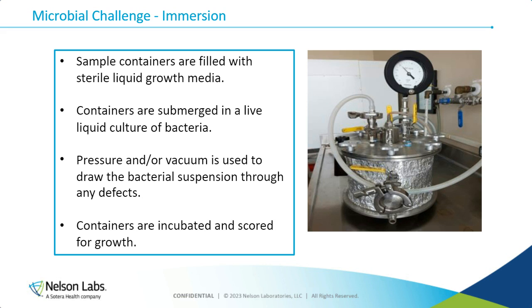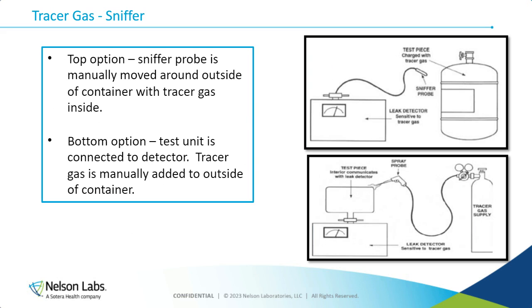Maybe you spend a week or two culturing your bacteria. Then you're going to put the samples in there. You're going to pull a pressure, sometimes vacuum and pressure, sometimes just vacuum. The vessel we have is capable of both. And then you're going to take the containers out, you're going to clean them off, and you're going to incubate them for another week and then see if the media turns turbid, and you're looking at that visually. So this test, you can see, takes quite a bit of time and expertise to perform.